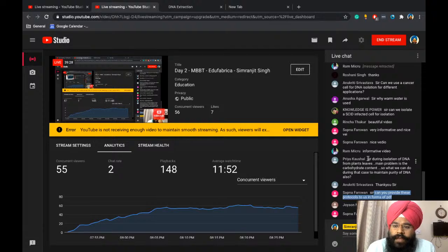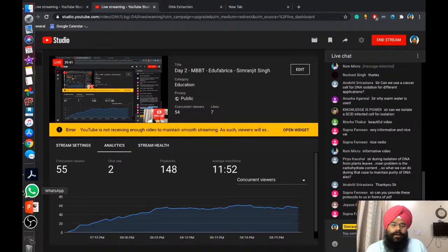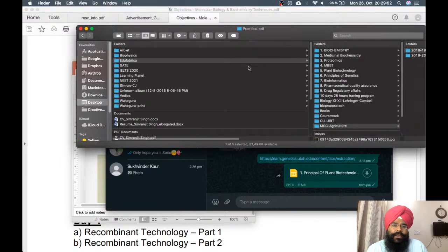So a student is asking us about the problem of carbohydrate content. What can we do to maintain the purity of the DNA also? Of course, you have to check by the OD. Let me recall what I shared with you yesterday.